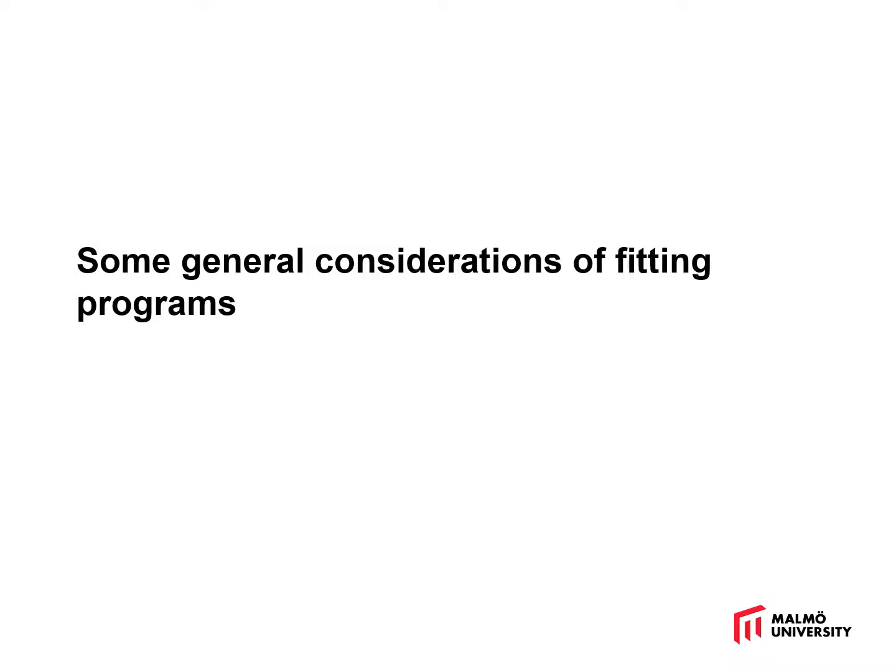So what I'll try to give you now are some general considerations in terms of fitting. How to constrain parameters and how to use the software. In this case, it's SasView. We will be doing some actual examples of fitting in the practical sessions, but at this stage, I just want you to think about the buttons that you press and how you get the answer.